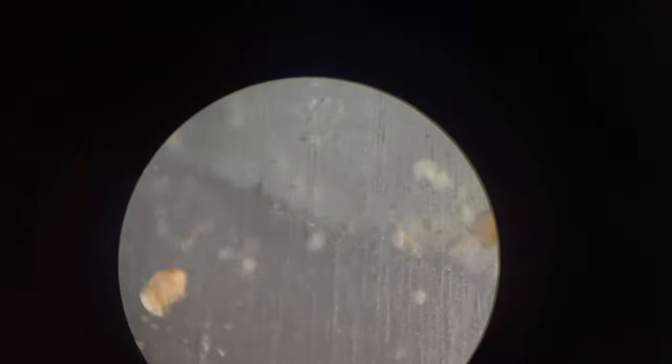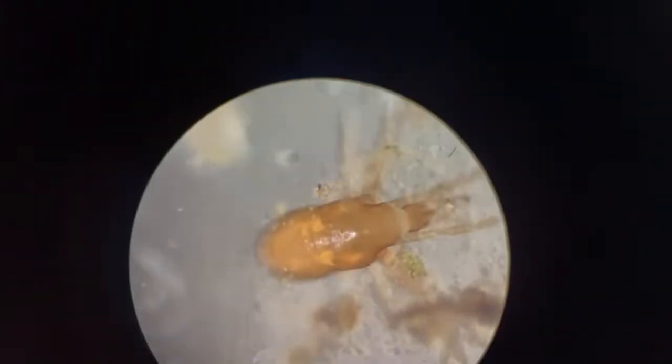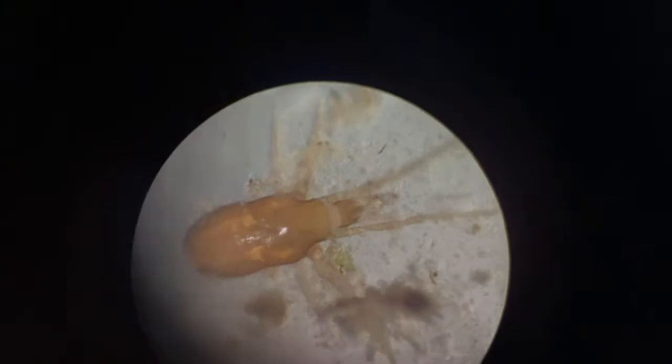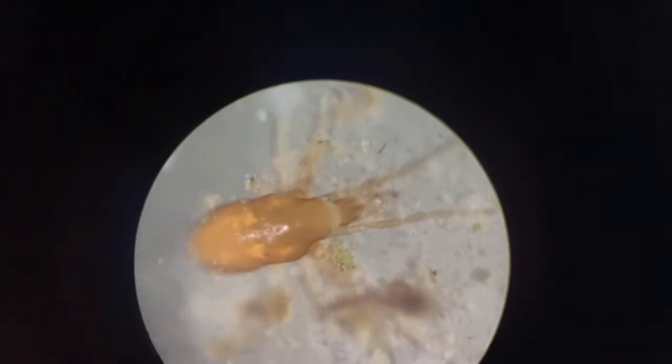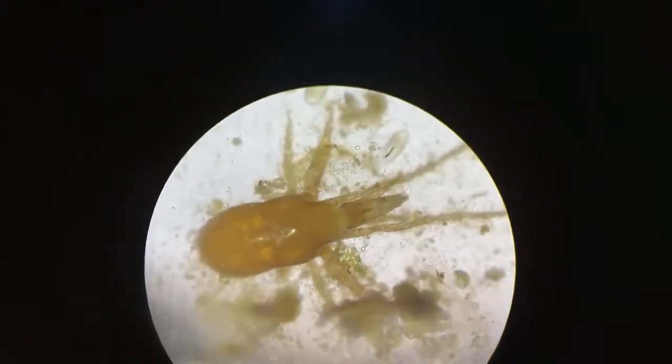So let me get it a little aligned. Bear with me for doing that. I'll soon fix it up, and then we can simply observe it. And you can see some protists already, some protozoans in their true color, and there is a tick, as I'd said. Now, if it was in the normal light system, the image would have been a little darker. I'll show you how.